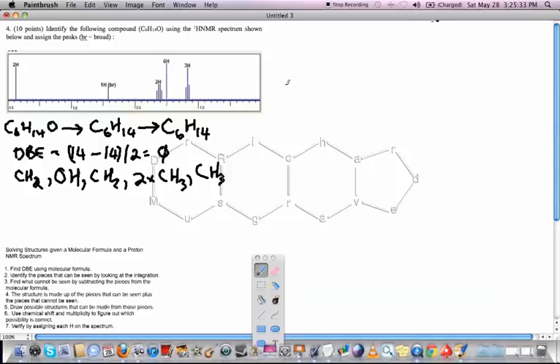The next thing I want you to do is to see what we're not seeing in the spectrum. Everything here is stuff that we're actually seeing from the spectrum. Let's see if we can figure out what we're not seeing. The way we do that is we take our full molecular formula, and we're going to go ahead and subtract out everything that we actually see in the spectrum. So we've got CH2, we've got an OH, we've got another CH2, we've got two CH3s, and we've also got another CH3.